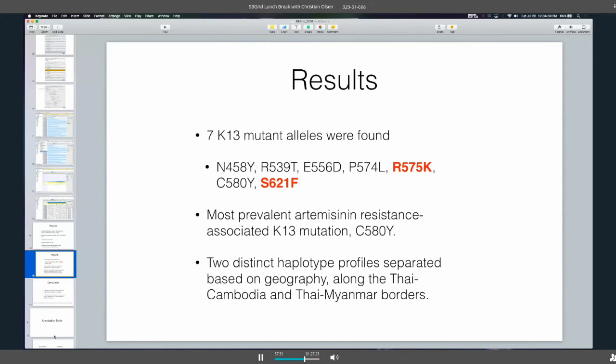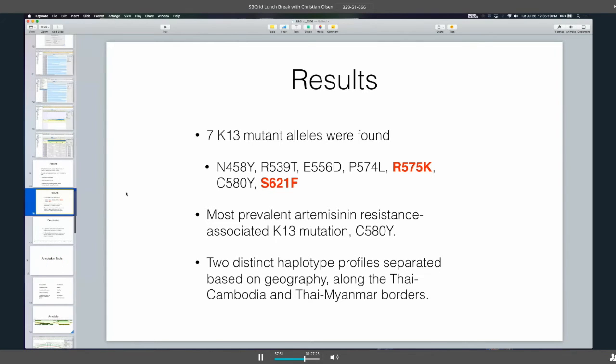We actually sent it to the same workflow as being used in Senegal right now to track artemisinin resistance in Africa. And we've got some interesting data to publish here. It's actually submitted for publication, but with a minor tweak to a couple steps of the workflow, we were able to reuse what we did in Thailand in Senegal.